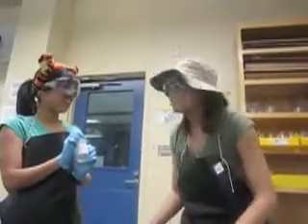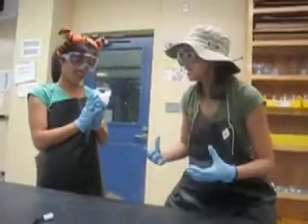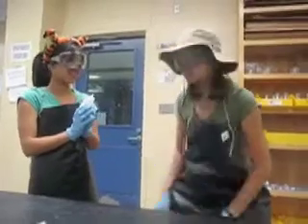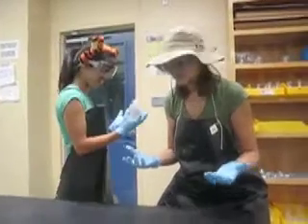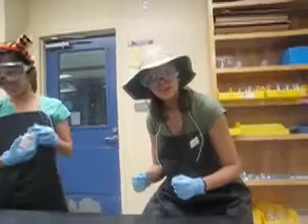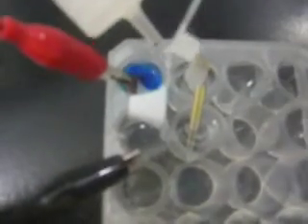Why, if we add ammonia, a complexing agent, to the copper side of the copper zinc cell, it'll bind to the copper 2 ions to form a complex ion that's really hard to reduce, and that reduces the voltage. Wait, put those gloves on, and make sure you add it 1 drop at a time, and stir, stir, stir with a toothpick. Is it working? Observe the color change. If it did, copper 2 ion is present. And lo, the voltage has changed.